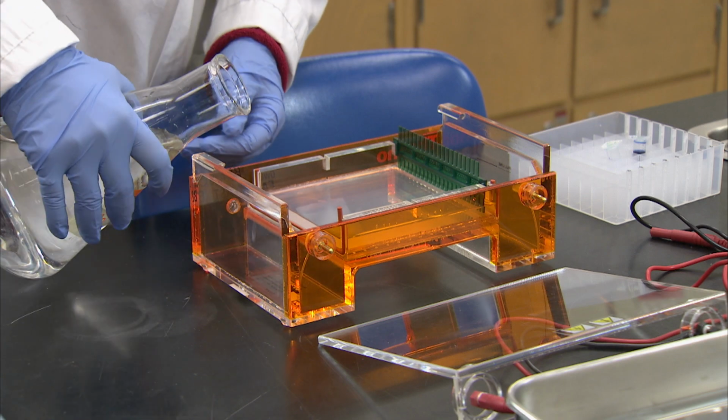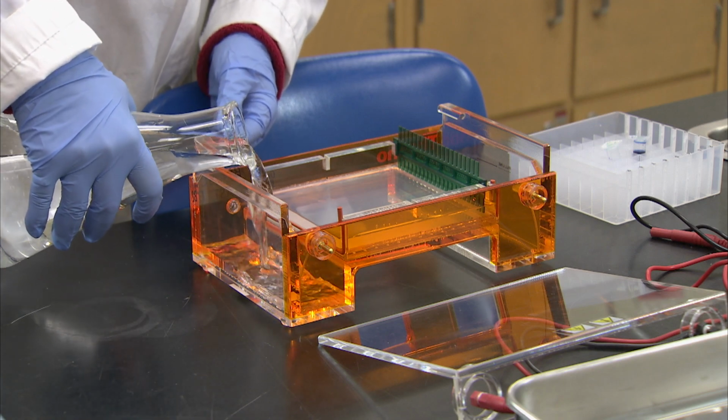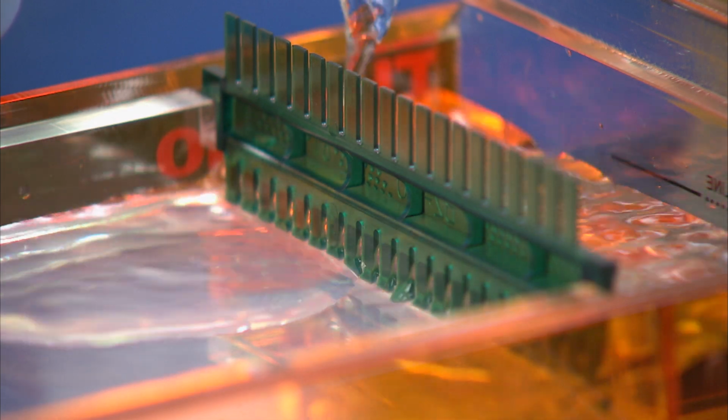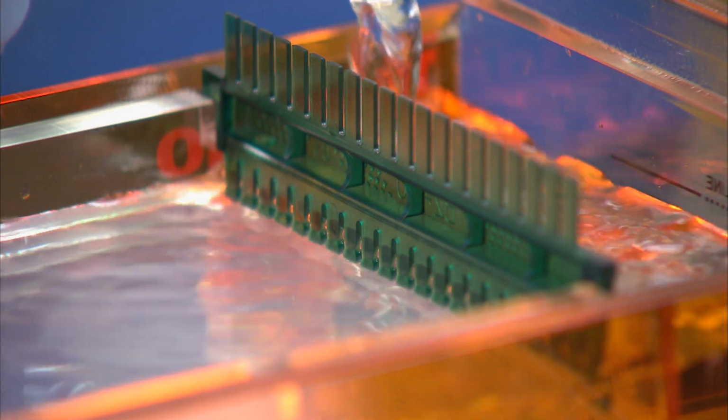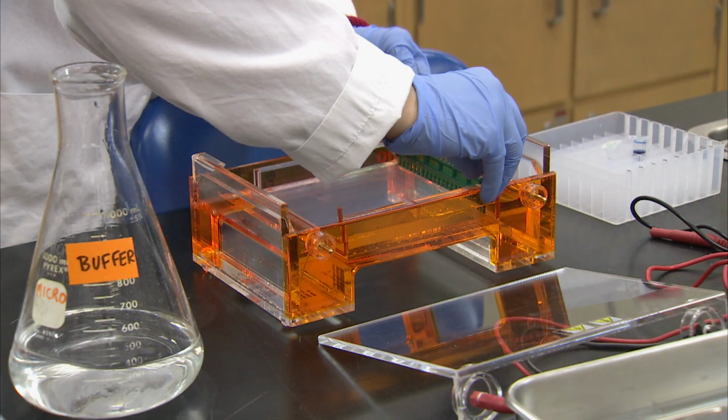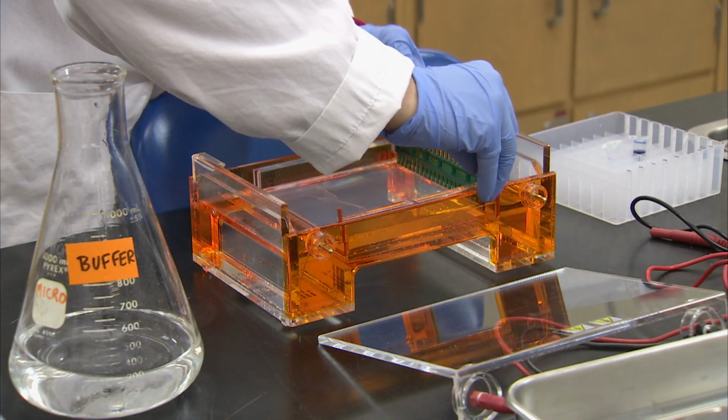Buffer can now be poured into the ends of the electrophoresis unit and to a level just over the top of the gel. The more buffer that is poured over the gel, the less quickly the gel will run. The comb should now be carefully removed so that the gel can be loaded.